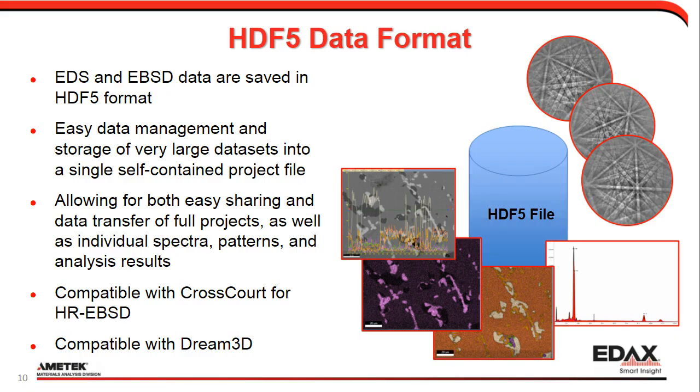Apex 2.0 is using the HDF5 data format. This is a self-contained file format. All of the data will be saved to a single project file. If you make any modifications to your data, everything will be saved back to the single project file. You can easily handle very large data sets and move things around. It allows for both easy sharing and data transfer of full projects, as well as individual spectra and analysis results. This file format is also compatible with other software programs.